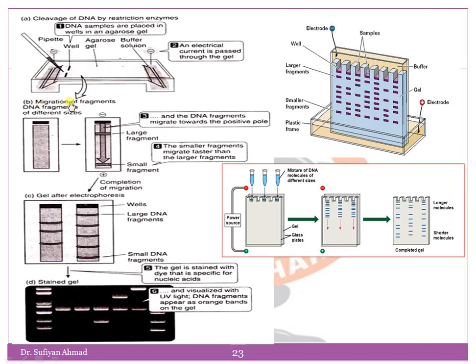The sample containing DNA mixed with loading buffer is then pipetted into the sample well, and the power leads are placed on the apparatus and the current is applied. It should be confirmed that the current is flowing by observing bubbles coming off the electrodes. The DNA will migrate toward the positive electrode, which is usually colored red.